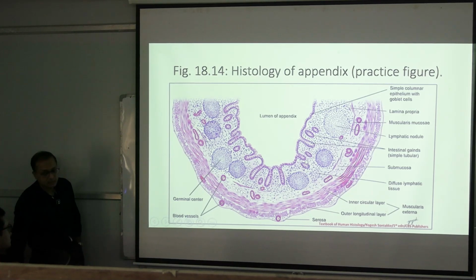It should look like this schematically, but it is not easy to find. Many slides focus on only one layer. Up to this is visible, many are not, but the hallmark is that it has four coats but no projections, villi being absent.